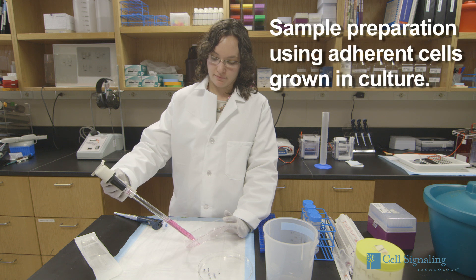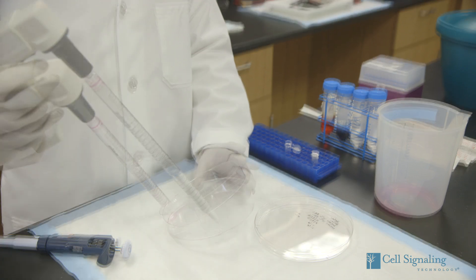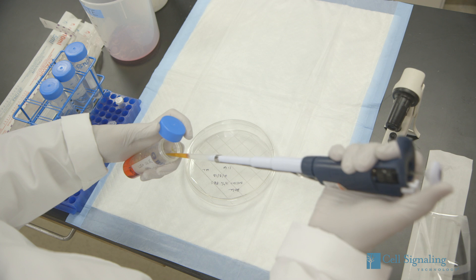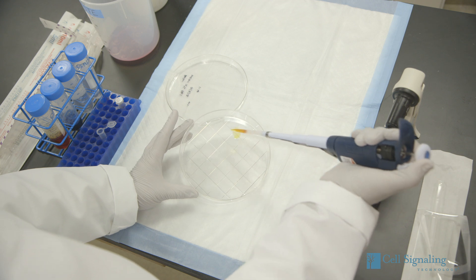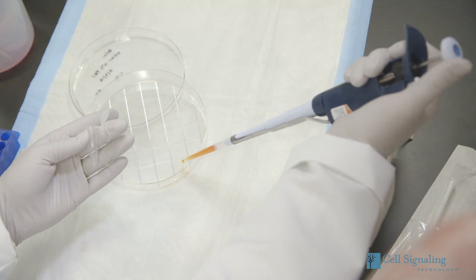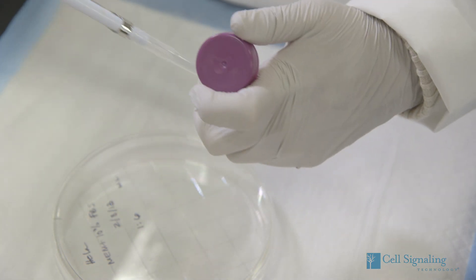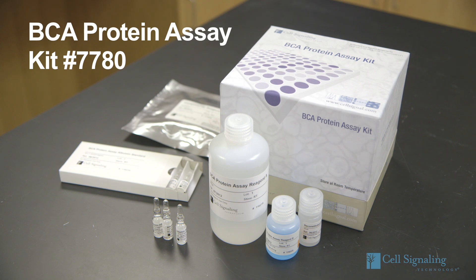To harvest the cells, aspirate the cell culture media and wash the cells with 1x PBS, then aspirate the PBS. Next, lyse the cells by adding 1x SDS sample buffer — add 100 microliters of buffer per well to a 6-well plate, or add 500 microliters to a 10-centimeter plate. Immediately scrape the cells off the plate and transfer the extract to a microcentrifuge tube. Keep the cell extract tube on ice. Alternatively, the samples can be lysed using 1x cell lysis buffer or 1x RIPA buffer. Both buffers contain the necessary phosphatase and protease inhibitors for common protein assay methods.